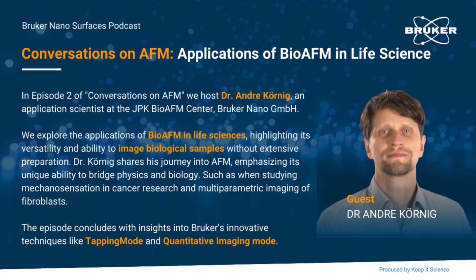Yep. I love the idea, but it probably would have been easier to take a skin biopsy rather than put the whole arm under the microscope. But then it's in vivo. True. Very good. Want to measure in vivo, yeah. Absolutely, which also is probably one of the big things, right? That in BioAFM you can literally measure in vivo in the normal healthy context, right? Exactly, yeah. So this is exactly it.